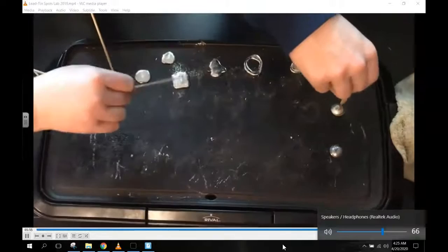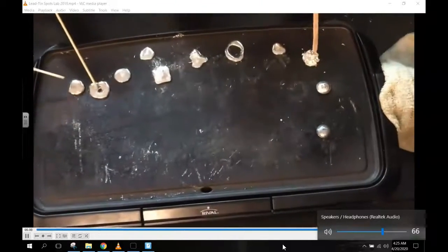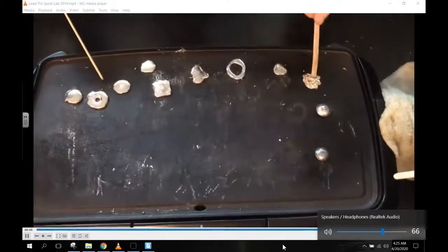It looks like a boat, yeah. See how the oxidation is on top? It looks like a boat that has gone. See, the top is almost cut off of it. Oh my god. You're making a canoe? Heck yeah, I am. Pull the cords. Sorry, that was cool. It's getting hot.